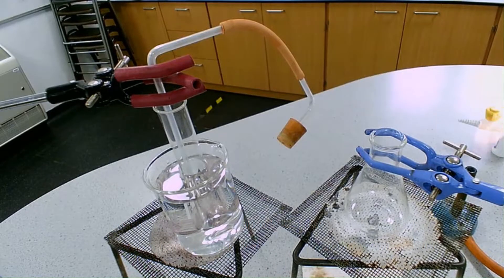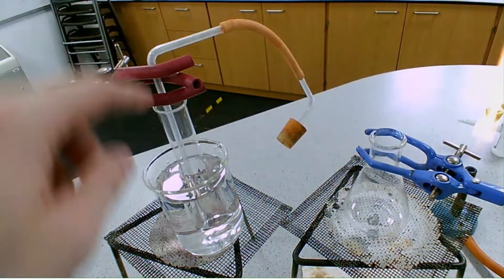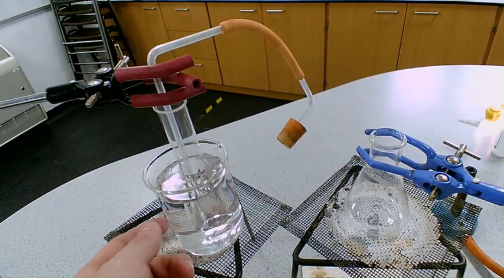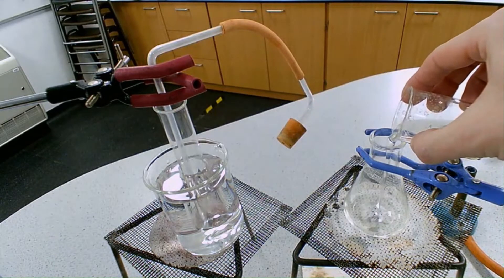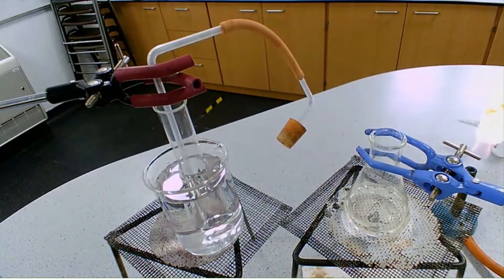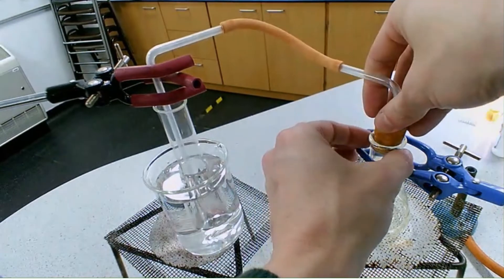To obtain our distilled water from our seawater, we use this setup: a conical flask, a delivery tube, and that delivery tube going into a boiling tube which is sat in a cold water bath — ice-cold water. We need to add our seawater to our conical flask, so I'm adding 50 centimetres cubed, and then we place the bung in the top.